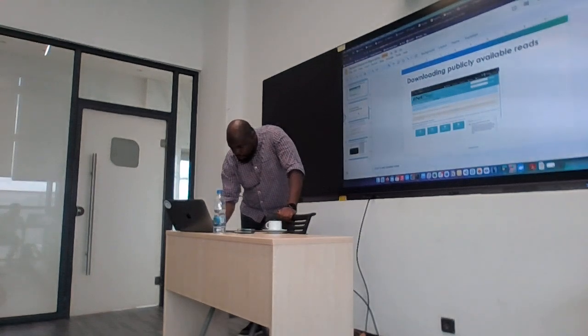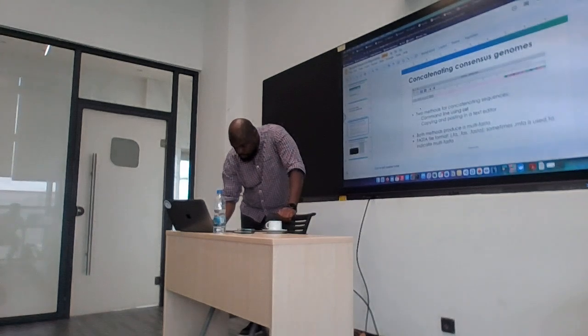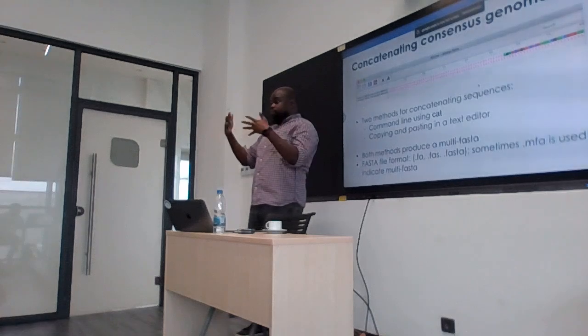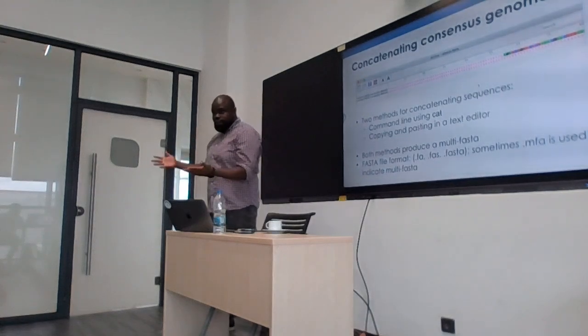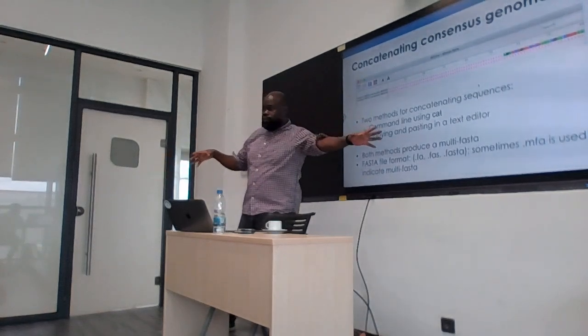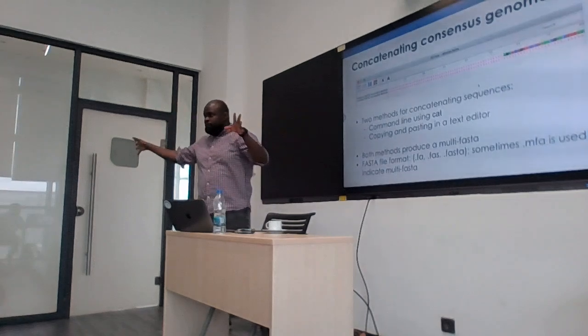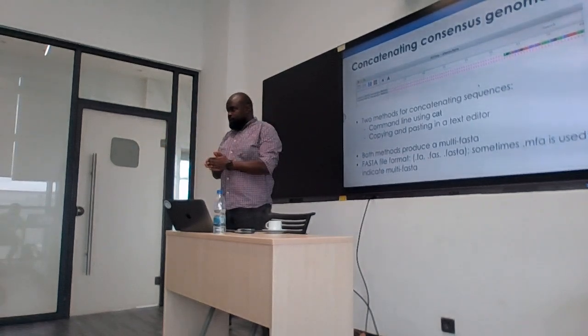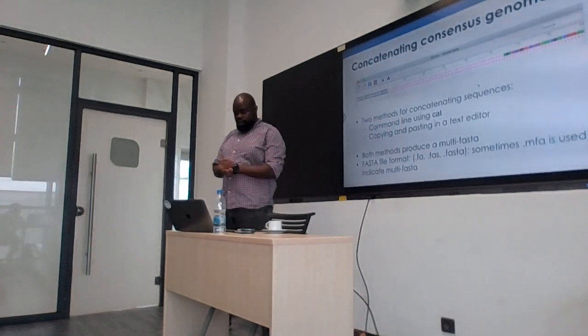Let's say we've downloaded our publicly available data. The other thing I want us to do is, often what you will do is concatenate sequences, right? So you have a file with different sequences, you have another file, now you want to join them together.